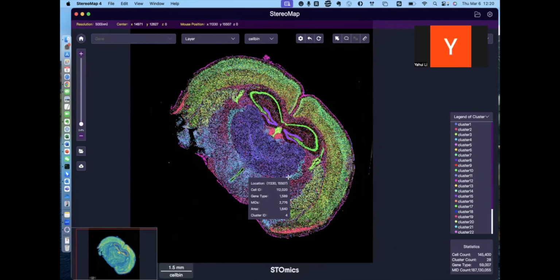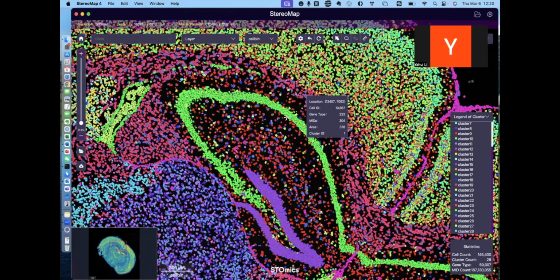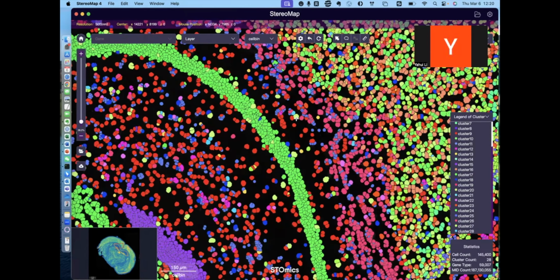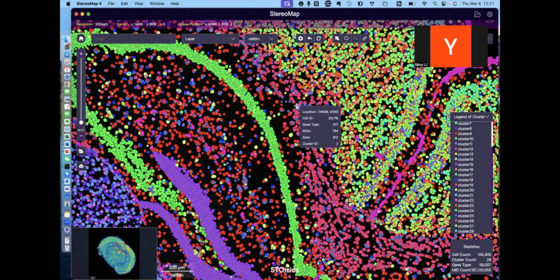This is the result for the cell bin clustering. On the right side, we can see there are 28 of them. Let's zoom in. So this cell bin uses the single cell shape here. How do we obtain the single cell, or segmented individual cell? As I mentioned earlier, it's done by image-based cell segmentation.